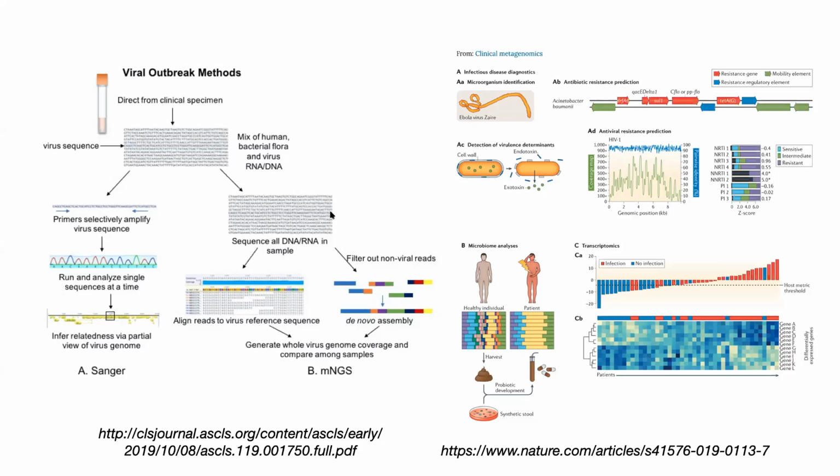When we are doing shotgun sequencing or metagenomic next generation sequencing, we are typically taking all of the DNA or RNA in a sample. We can align some of those reads to the reference human genome or the host genome, remove those completely from consideration, and the other ones could reveal something about the sequences by mapping them on a database or by mapping them on a select few genomes that we have selected for this study.